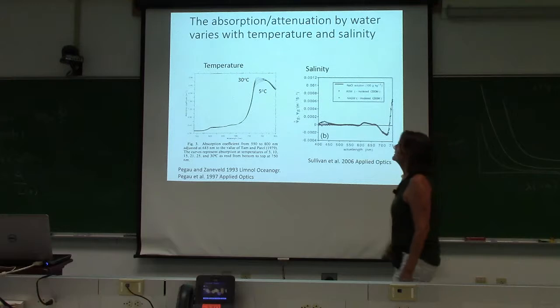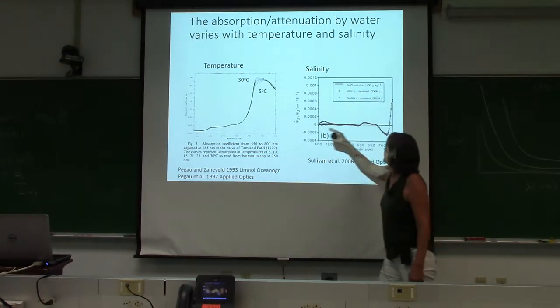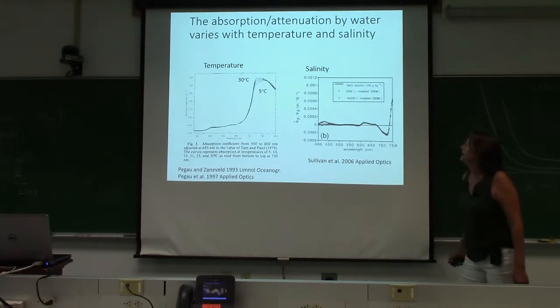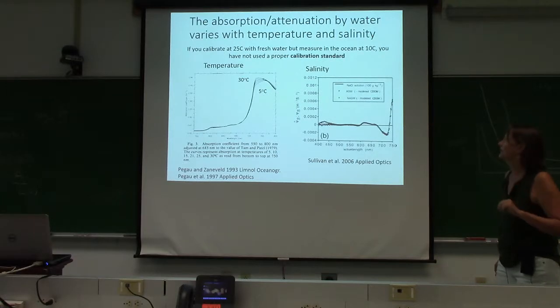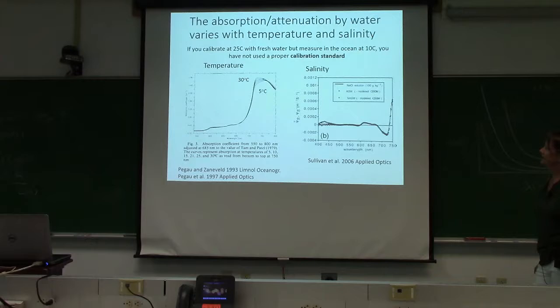Okay, so here's the absorption by pure water. If you don't do the temperature correction for pure water, you have these really big dips, so you need to do that correction. If you don't, you'll have a big error in your absorption. So make sure to use the proper calibration standard, which is the water at the correct temperature and salinity.